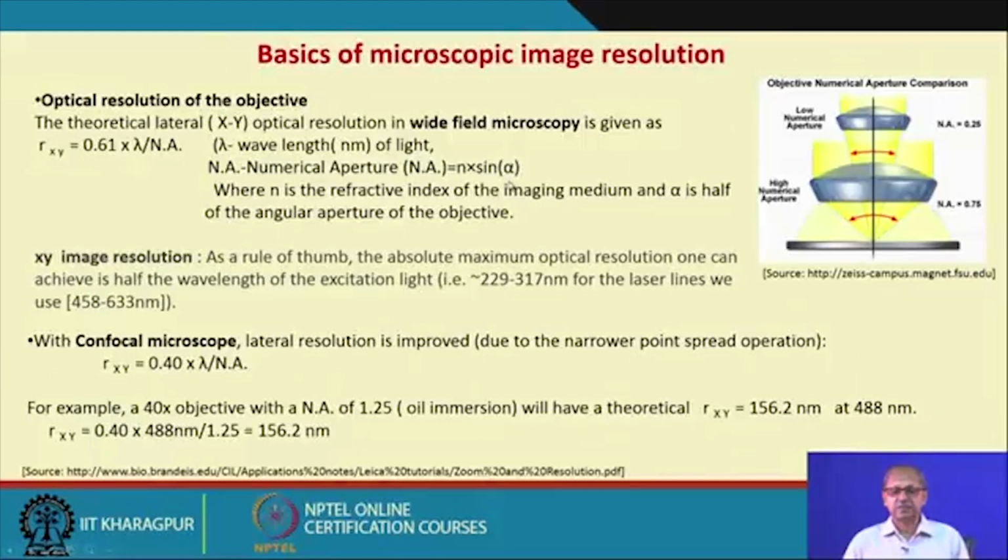It depends upon which type of objective you are using and what is the media. It may be air, it may be oil. If it is oil, then the refractive index is increasing. So, you can get more microscopic image resolution.